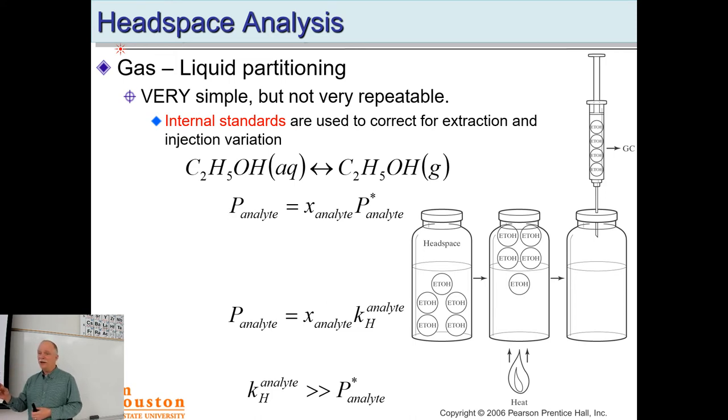You put a drop of acid in that solution with the stir bar going, and all of a sudden it was like, wow, let's get this in the hood. So we learned right away, let's do this in the hood because we can't stand it. Your nose is so attuned to that that they actually started, they bought a couple of them.